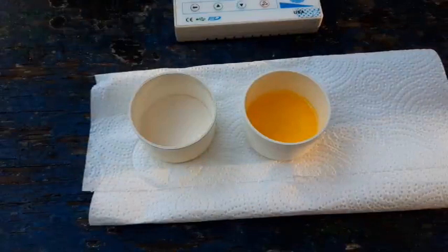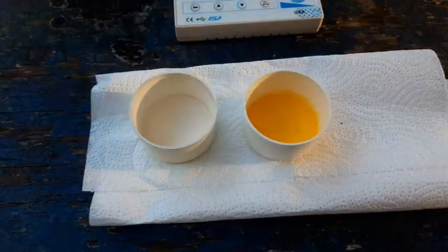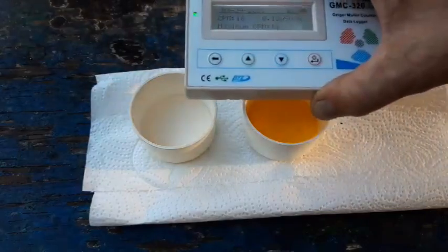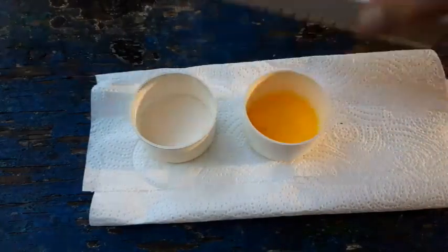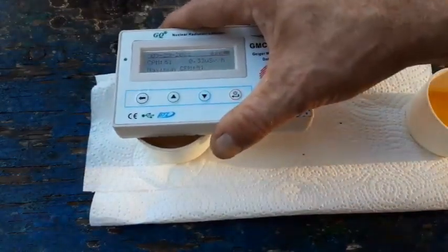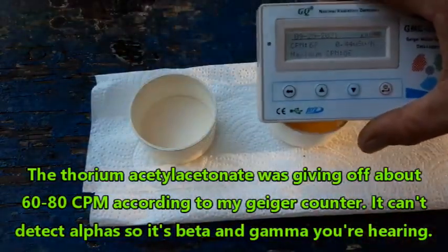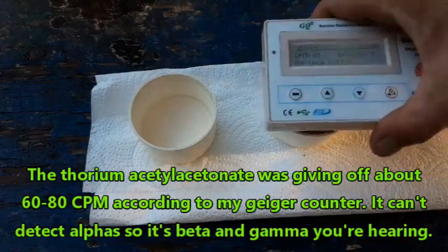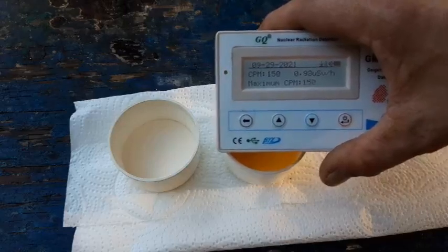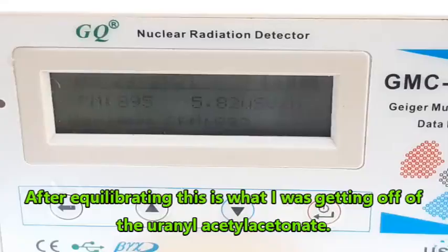Here are the filtered products. This is the thorium acetylacetonate, and this is the uranyl acetylacetonate. I've been able to detect the thorium and uranium with the Geiger counter. With the thorium I was getting roughly about 80 counts per minute. I haven't measured the uranyl acetylacetonate yet, but being a uranyl salt it's much more radioactive than the thorium salt — it makes the Geiger counter scream a little bit more. That's pretty impressive.